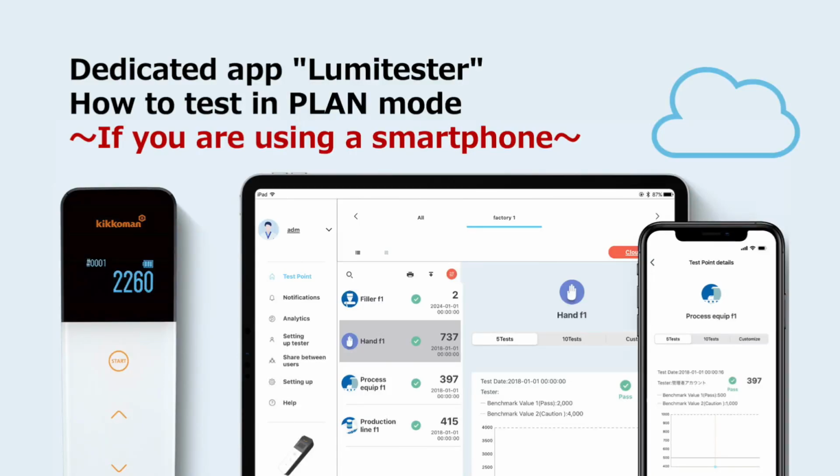In this video, we will explain how to test in plan mode. The app screen shown in this video is for a smartphone. If you are using a computer or tablet, please see another video.